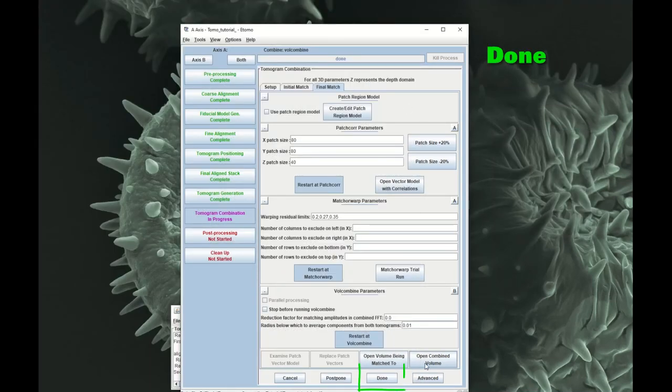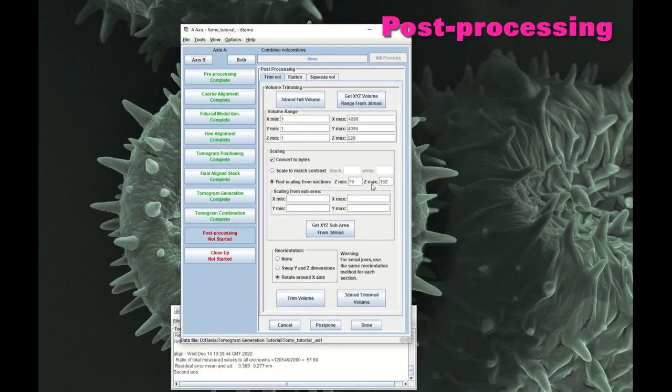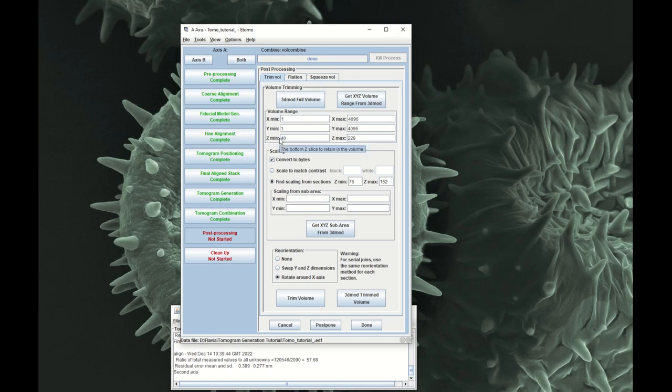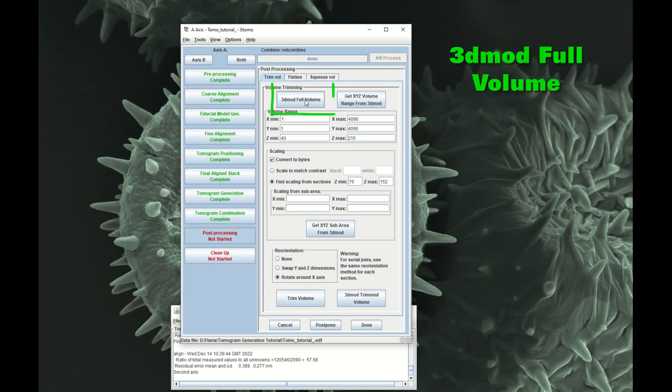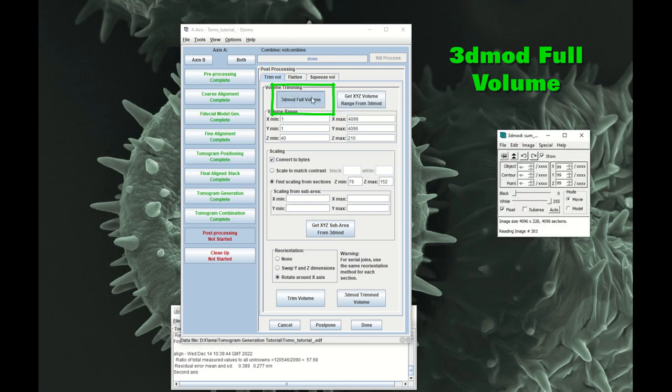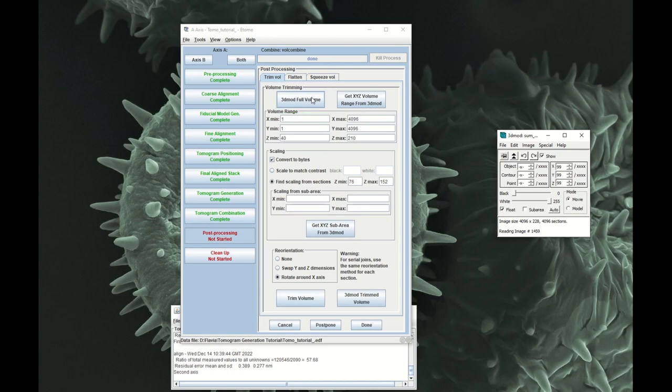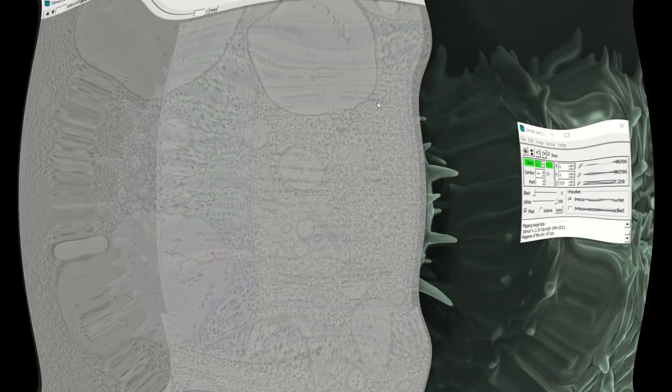This is the trimming options. So I know that I want in here I want 40 to 210. If you don't know yet, you can also open the 3D mod full volume and then get the Y, X, Y and Z volume from 3D mod.